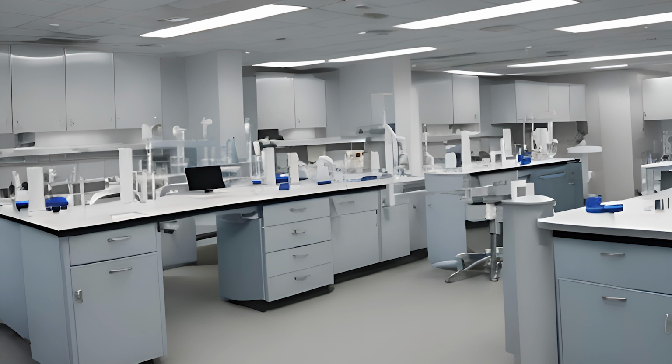Key elements to have a safe lab include a formal safety program, documented policies, a chemical hygiene plan, a control of exposure to bloodborne pathogens plan, a tuberculosis control plan, and an ergonomics plan. You'll also need to identify specific occupational hazards for your lab. Typically, that will include biological, chemical, electrical, and fire hazards. All of these will need to be clearly identified and have a documented policy for employees to read and learn on how to deal with each of these hazards.